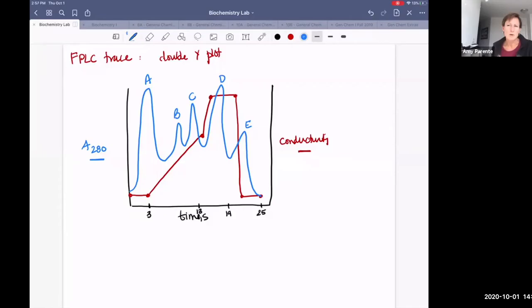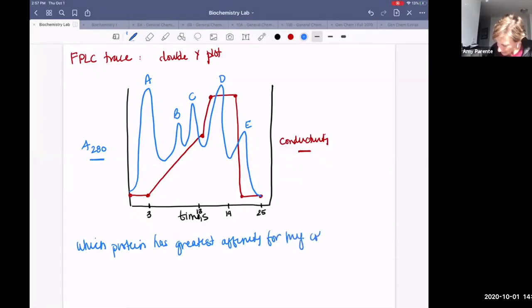Let me ask you guys a quick question first here, and I want you to answer in the chat. Which protein, A, B, C, D, or E, has the greatest affinity for my column? So think about it for a minute, then let me know in the chat what you think your answer is.